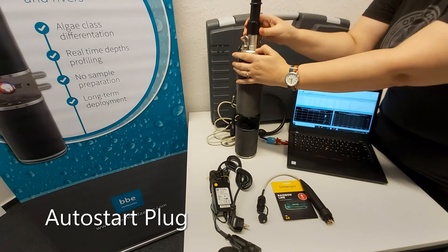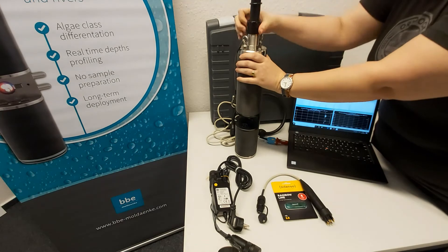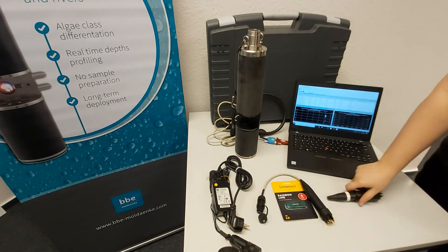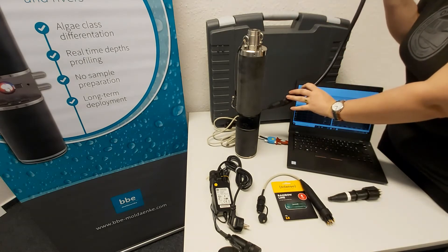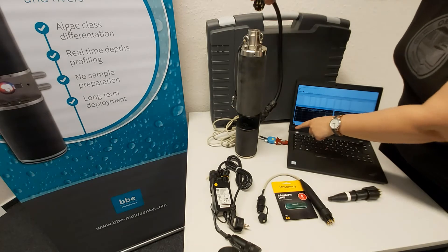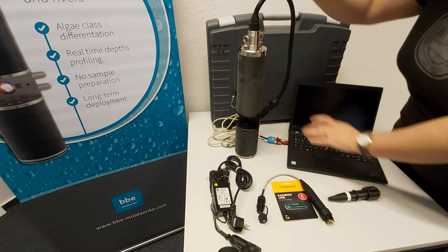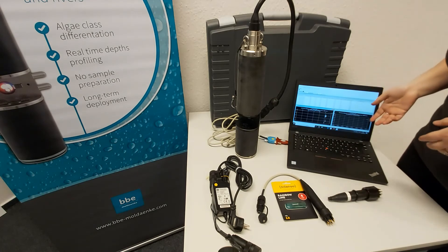In order to set the measurement settings using the auto-start plug, you have to first, before you go into the field, set the parameters in the BBE++ software, which you can see here on this computer. In order to connect the FluoroProbe to the computer, we have a short data cable here, which is connected to a USB converter that can be plugged into any USB port on your computer. We would simply plug this in here on top, and then we can set any measurement parameters we want on the computer.